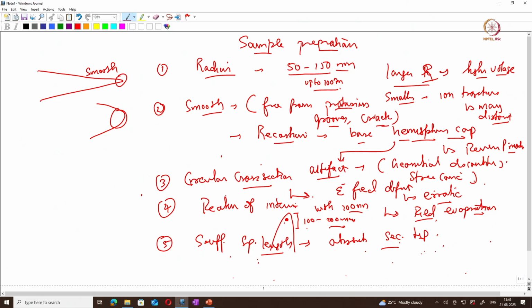I will go through the sample preparation by focused ion beam or electropolishing, but before that I need to discuss this secondary tip. Usually during the sample preparation, on your main needle specimen, it is possible that a small protrusion develops on the sample surface. During field evaporation, your voltage may be enough that there will be field evaporation from these tips. So you will get extra ions which are actually not from the exact specimen surface which we want. So it will generate a wrong reconstruction or artifacts in the sample.